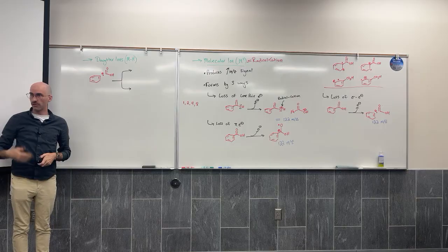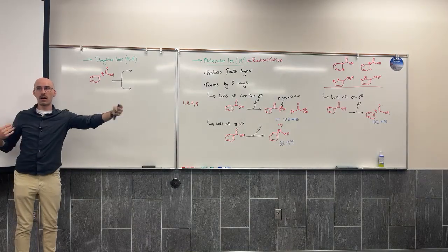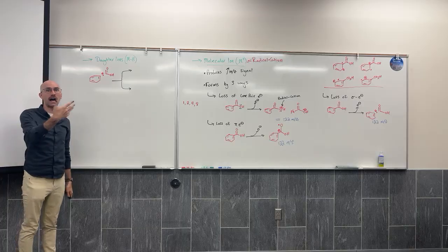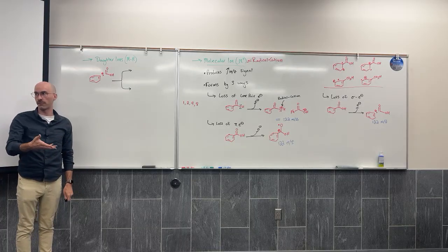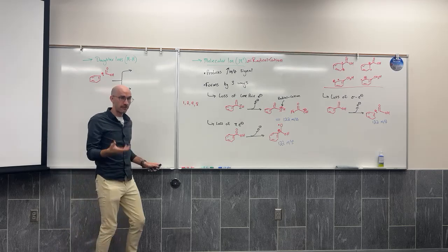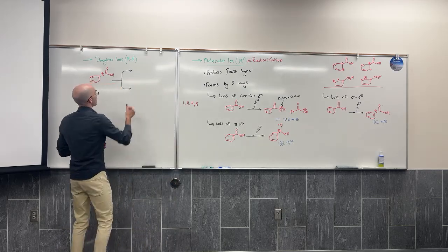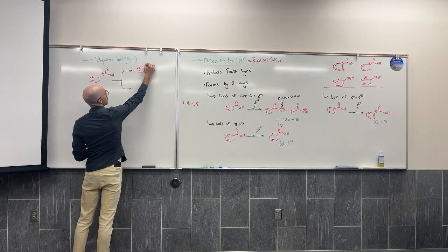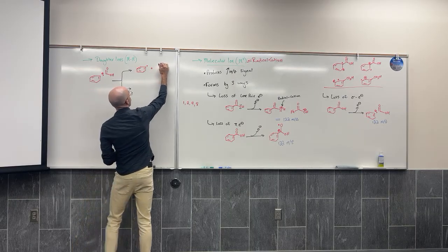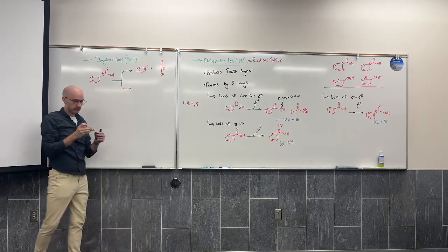Every time we cause a fragment, every time we cleave the molecule to have an ion that is not the entire molecule, but just a daughter of the molecule, a fragment of the molecule, there are 2 ways that it can happen. Imagine that the ring takes the radical, which means that the carbonyl carbon has taken the positive charge.